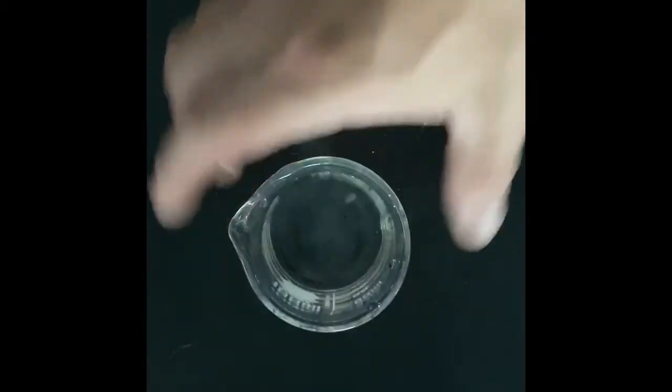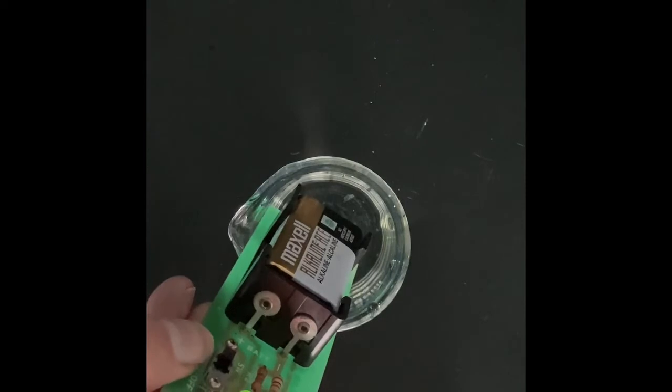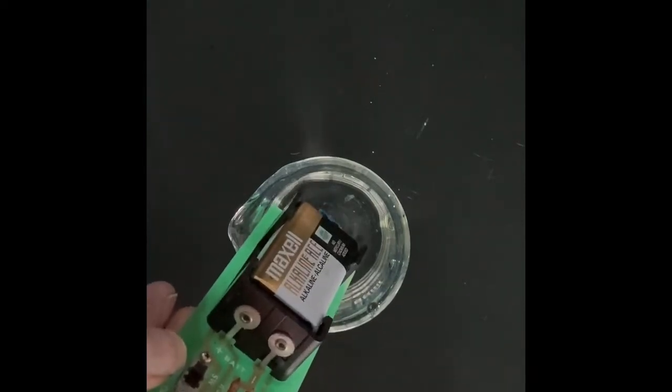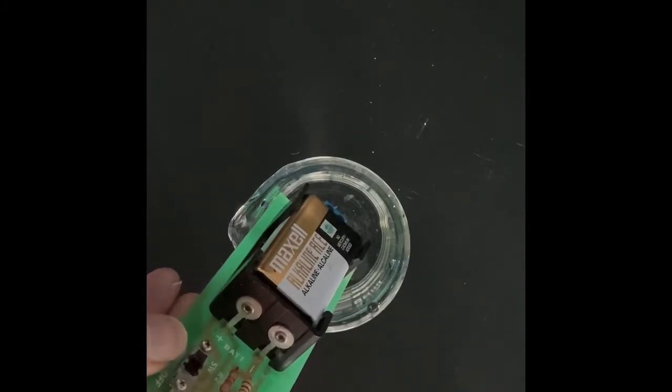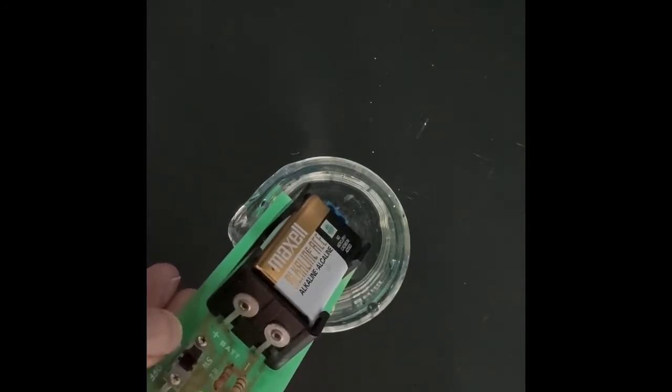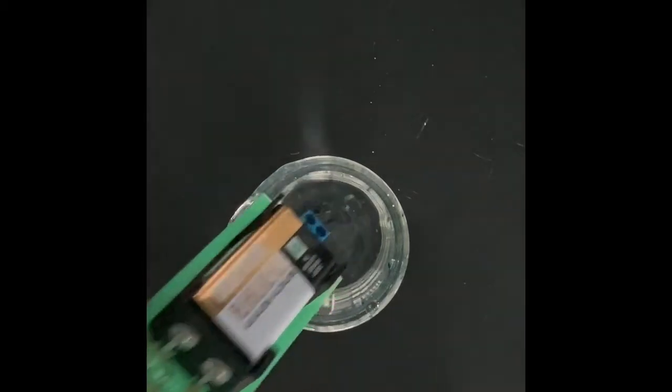Next, we have sodium chloride. Wowzers. Notice the difference from that last one to this one. So both the red and the green are pretty bright on this one, you guys. They almost blinded me, they were so bright. All right, everyone good? And last but not least is our good friend sucrose.